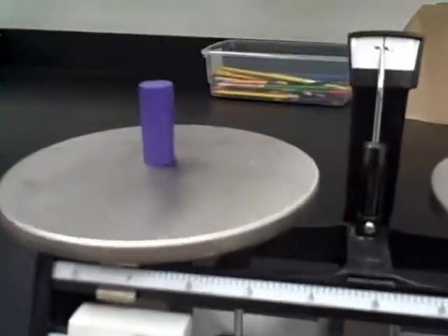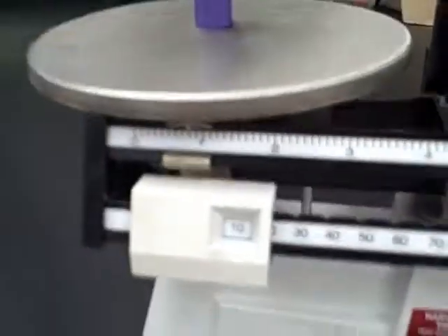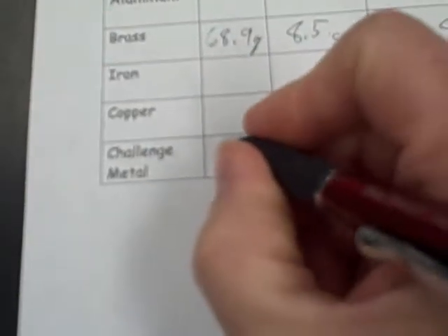So the first step is to take your object, let's say I'm doing this purple cylinder here, I get its mass, you all know how to do that, so this would be 10.8 and you record it in the mass column, 10.8 grams.